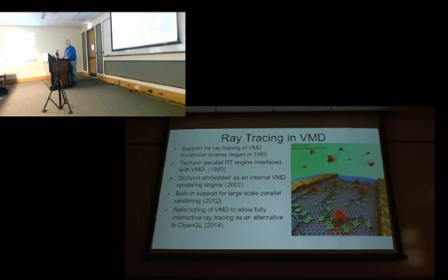Any other questions? Yes? What about the bridging? So there are scripts out there that I've seen others write that will do those kinds of calculations also. But I don't think we have any posted, so that's something you'll have to search the mailing list for. We have a very active mailing list. I don't know how many postings we have on it now, but I think it's on the order of 20,000 postings. And it's searchable both in Google, and there's a little search box on there. And, by and large, any topic you can think of, somebody has asked about at least once before. They may not have an answer that you like, but it's probably been discussed once or twice.